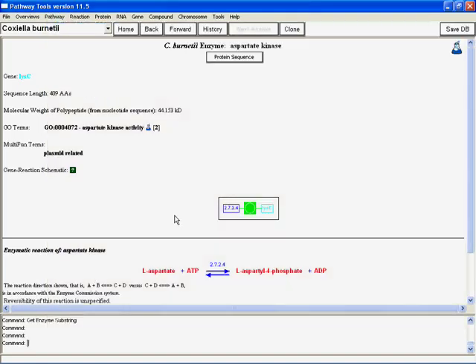So, and then if I again hit OK, I see that, okay, the GO term now appears on the protein page, which is very exciting. And there's this little number 2 there. And that says, well, there's an unimported citation there. So how do we solve that problem? We go up to File, Import, Citations from PubMed. And now we click that and then watch. And you can see the process is going on down here in the lower part of the screen.